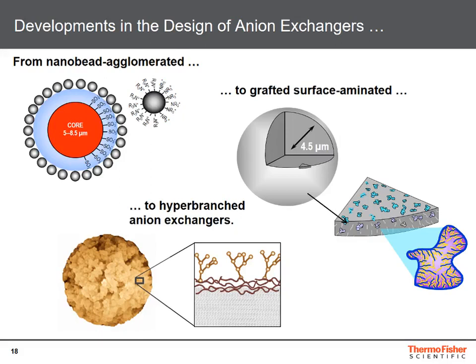That means we are grafting monomers onto the surface, but as a difference, those polymer chains are branching out, and all these branches are now carrying the ion exchange functional groups, so that the analyte ions diffusing to the surface of the stationary phase are not reaching the stationary phase surface itself, where they can do some non-specific, unwanted interaction.